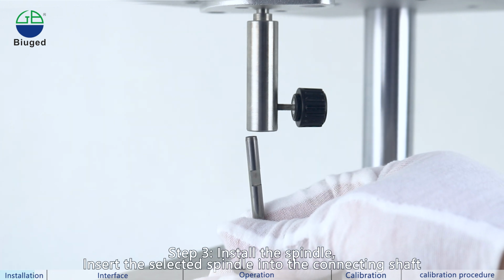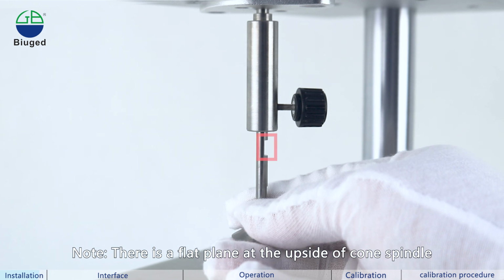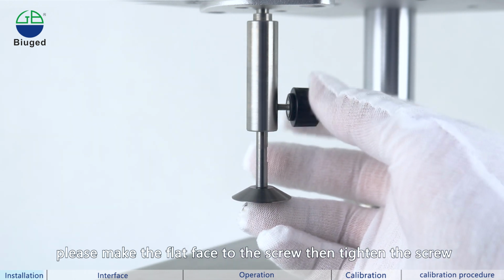Insert the selected spindle into the connecting shaft. Note, there is a flat plane at the upside of the cone spindle. Please make the flat face to the screw, then tighten the screw.